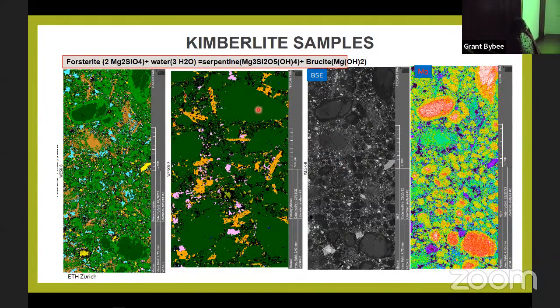So what we did here, Rebecca provided me with the EPMA data. Instead of using the library, I combined the EPMA data for both the olivine and serpentine, and instead of working only with the energy intensities, we also worked with the different BSE levels. As you can see here, the olivine is slightly brighter than the serpentine. Therefore, we're able to use the BSE levels to make sure she gets this image.